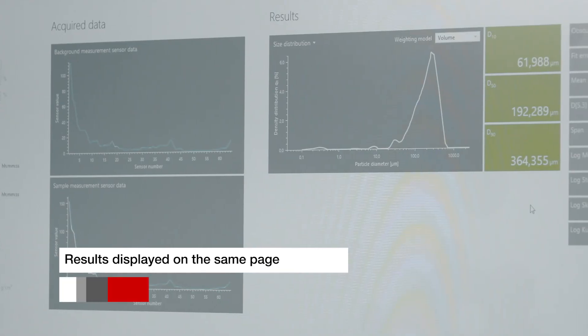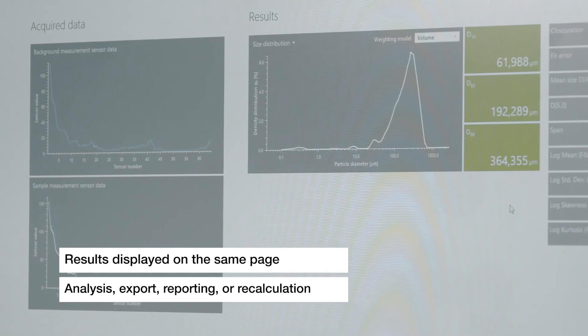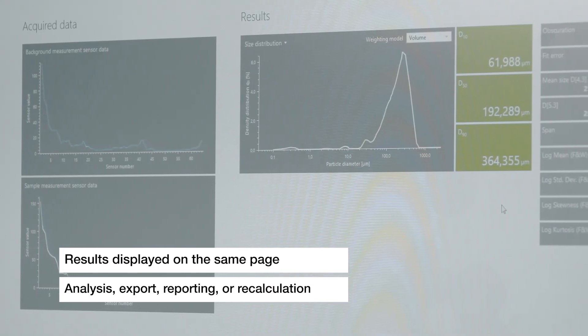From this point, the measurement can be analyzed, exported, compared, and reported, or even recalculated with different settings.